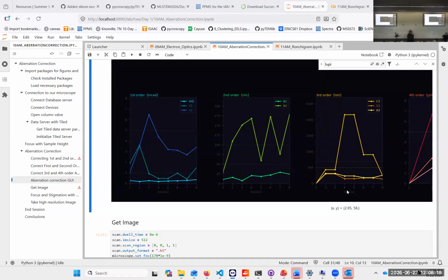I'm sorry. So maybe we make a Zoom session once, okay? We can check it out. That sounds like other aberrations are getting in your way. Look at your Ronchigram. If that is okay, then it's good.